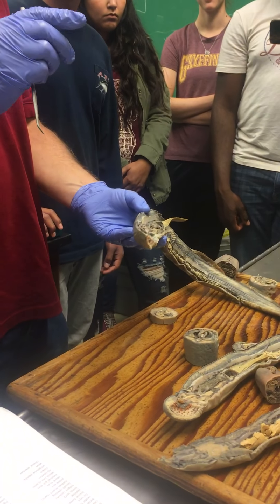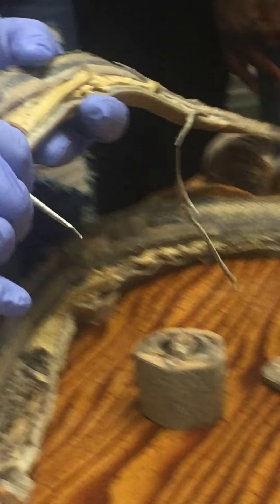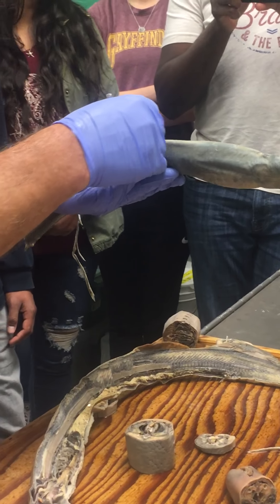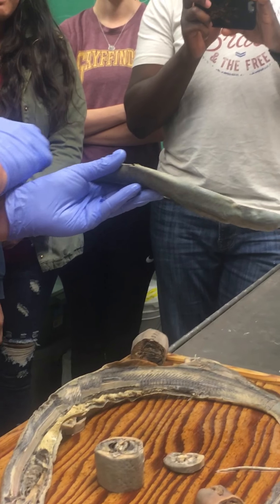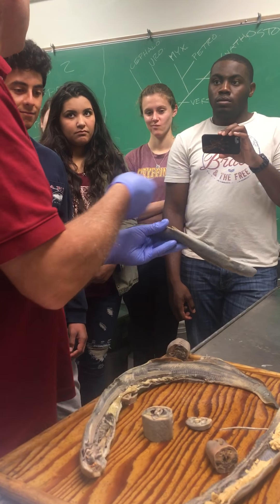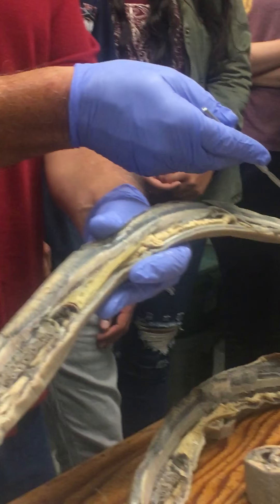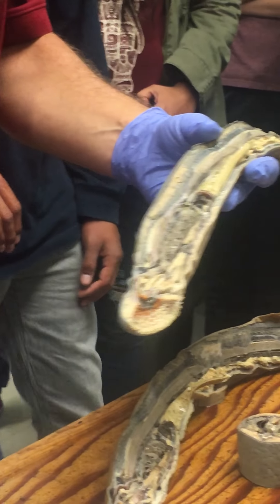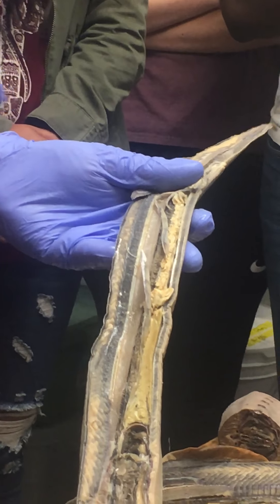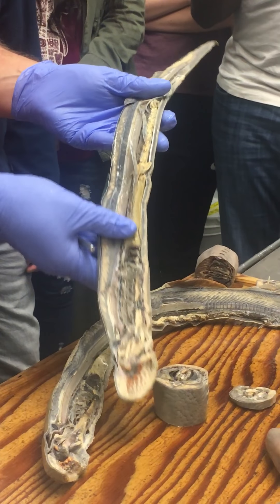The respiratory tube pulls water in through the external gill slits and through the internal gill slits and then sends it back out again — back and forth across the gills. It has an internal gill slit that leads into a branchial pouch where the actual gills are. Coming back from the esophagus is the intestine — a really straight, simple intestine with no stomach and no convolutions because blood is about the easiest thing in the world to digest. There is a spiral valve in the intestine, a fold that spirals around to increase surface area; this is a primitive vertebrate character also seen in sharks and some primitive bony fishes.